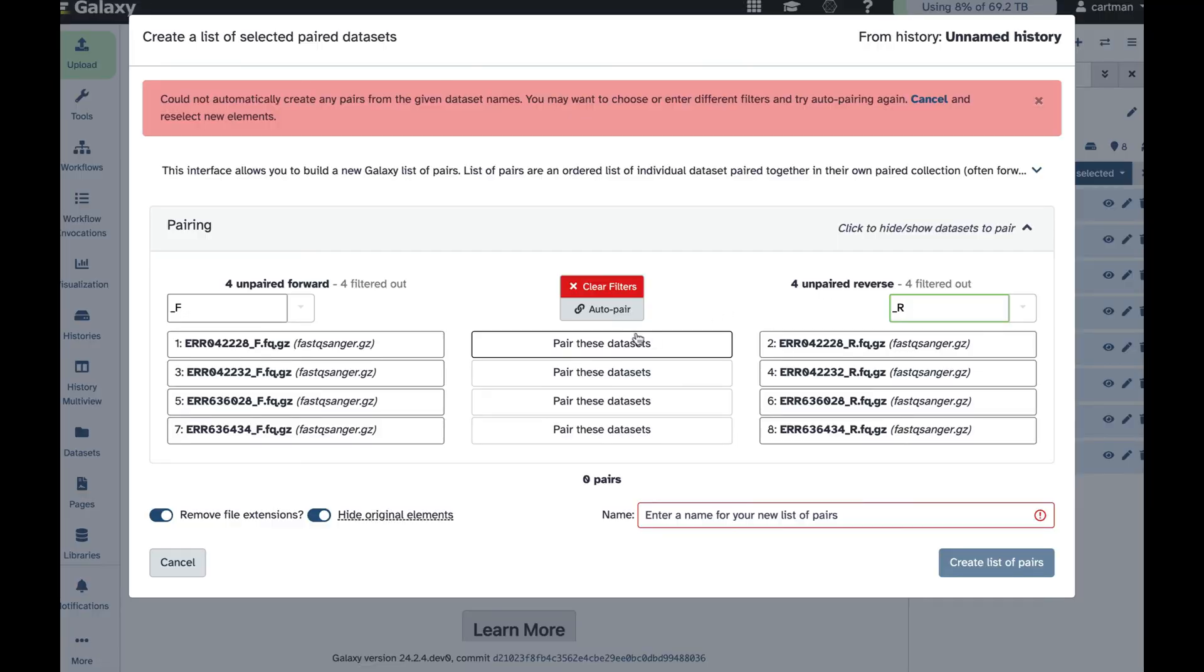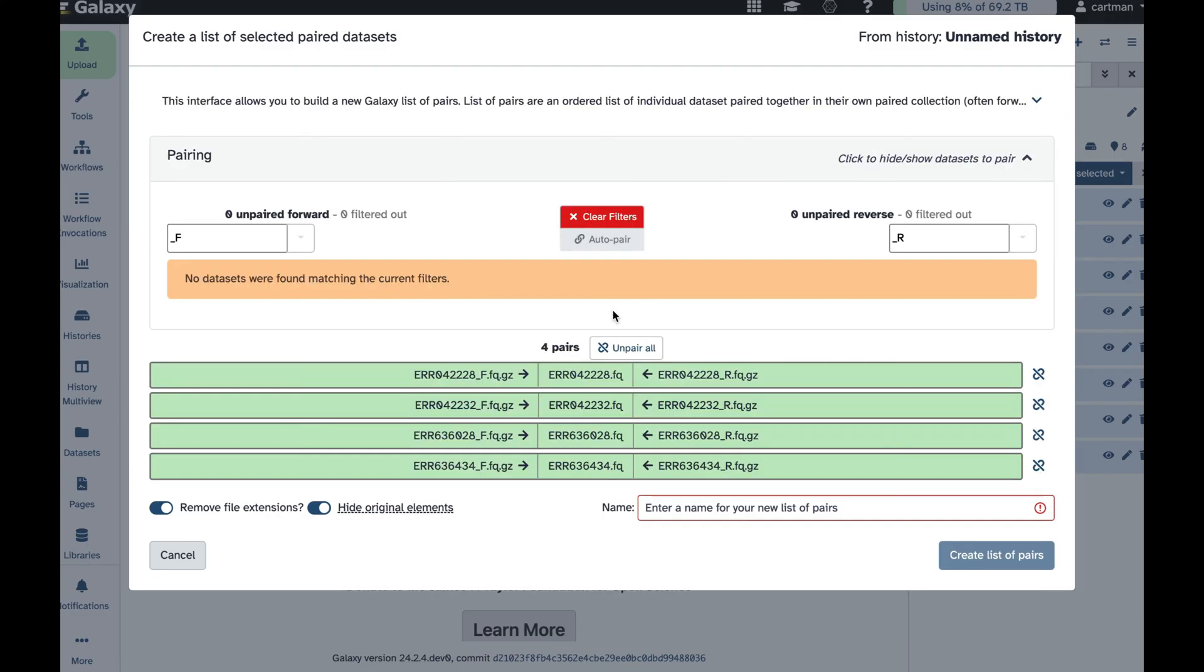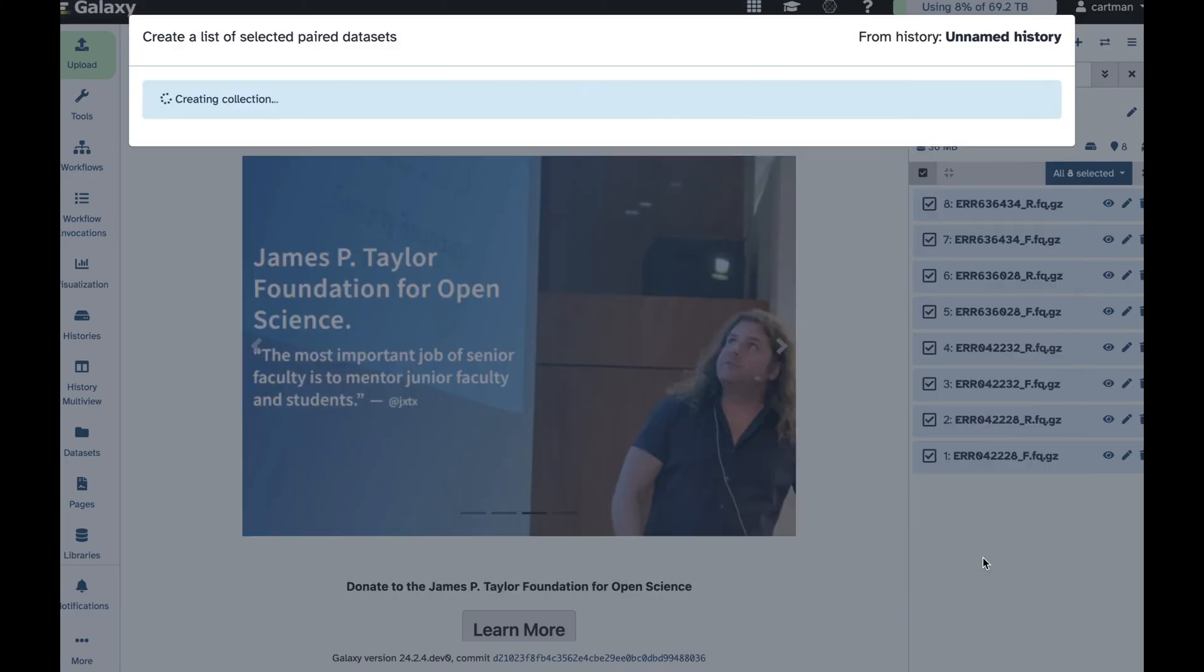So now we can either auto-pair them or pair them one by one. Let's auto-pair them. Let's call this new collection data, and just click create list of pairs.